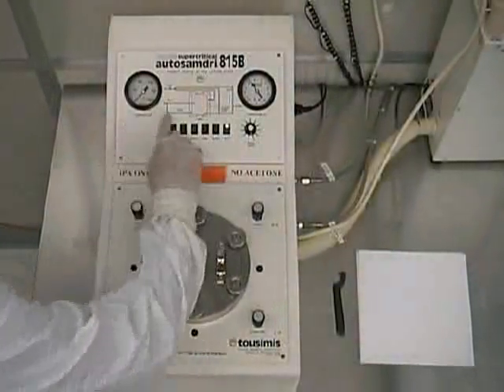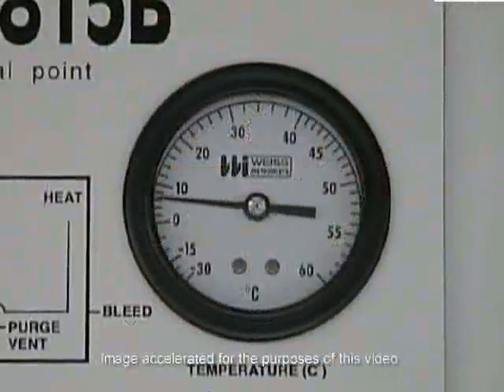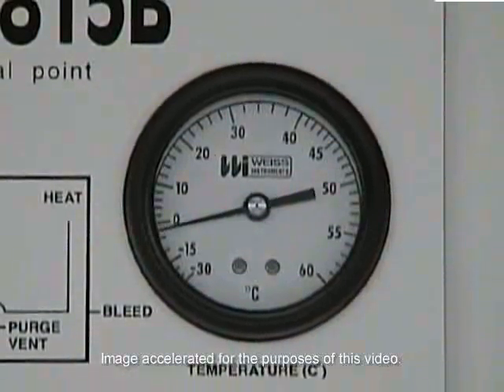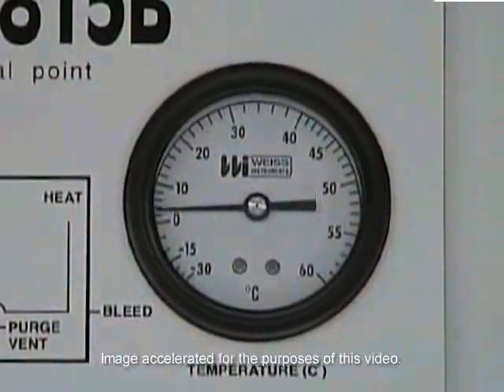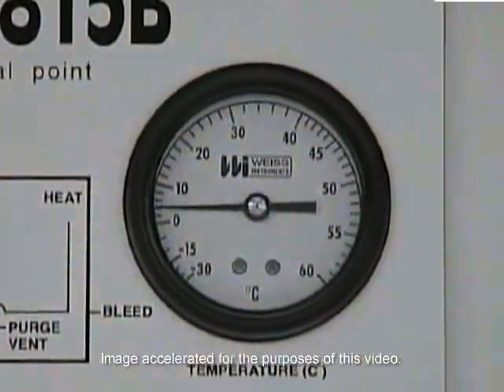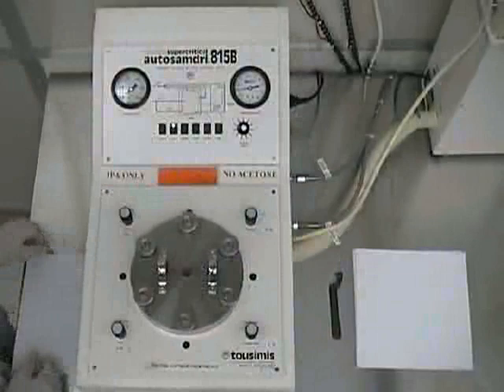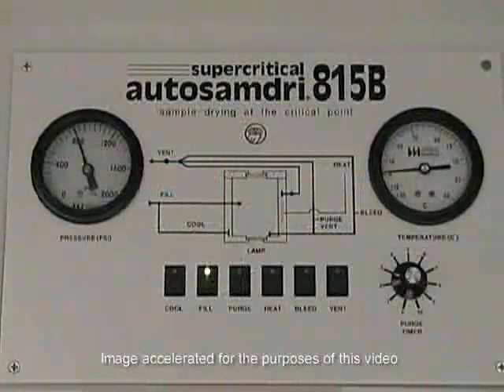Once the dryer has finished warming up, press the cool button. As the chamber temperature slowly begins to drop, you'll be able to hear the liquid carbon dioxide circulating through the unit. The 815B will continue cooling until the chamber temperature reaches zero degrees Celsius, at which point the cooling will automatically stop. Then press the fill button and the 815B will begin to fill the chamber with liquid carbon dioxide for eight minutes. From this point forward, the AutosamDry 815B will automatically cycle through all the drying sequence steps until the process terminates.